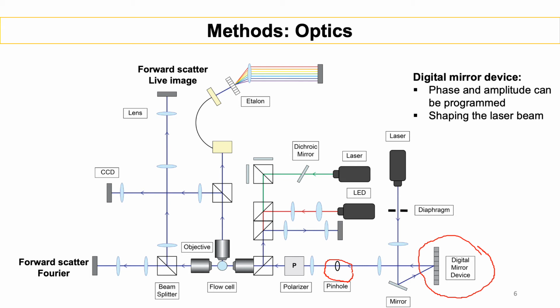The second direction which the scattering can go is in this sideward scatter direction, where we also measure the Fourier signal, and the backscatter direction. The backscatter direction is normally not present in other flow cytometers, which makes it a unique feature for a metrological flow cytometer. And it gives extra information about scattering of particles.